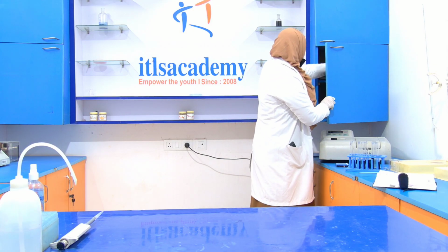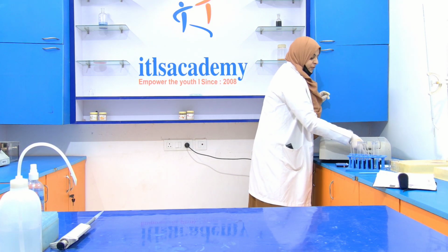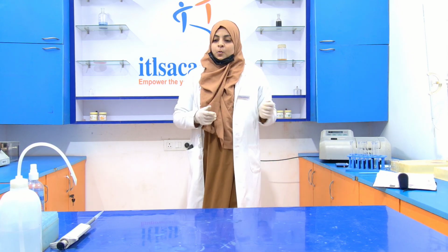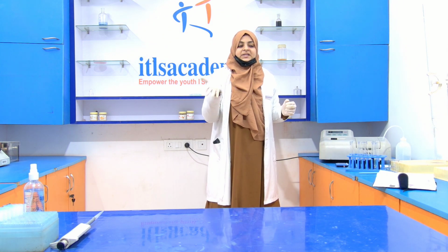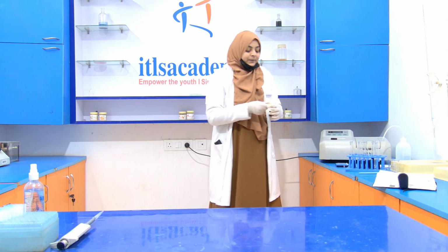This is how we take the reading with the spectrophotometer. We will start with the blank one. First of all, we take the reading of the blank. Then after that, as the concentration increases, we take the readings.